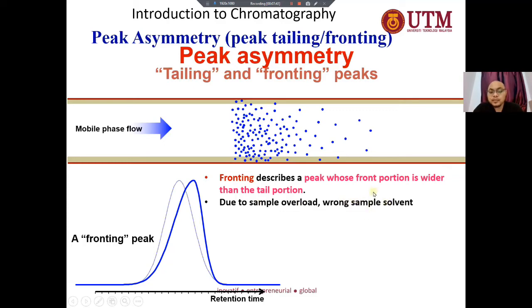To overcome sample overload, you can reduce the concentration, or you can reduce the volume of injection.